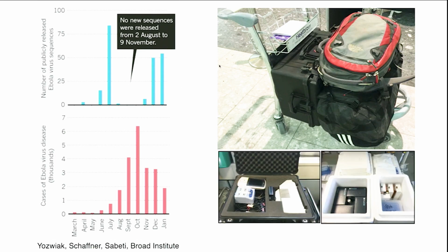Okay, our solution to this problem of how we get genome data in the Ebola virus epidemic is to try and deploy sequencing close to the sample. So rather than trying to expatriate samples from an outbreak area using quite reluctant courier services like FedEx, instead we would take the sequencer to the sample. And of course, this is analogous to what NASA want to do and have been doing with the Oxford Nanopore MinION, which is what we used as well.